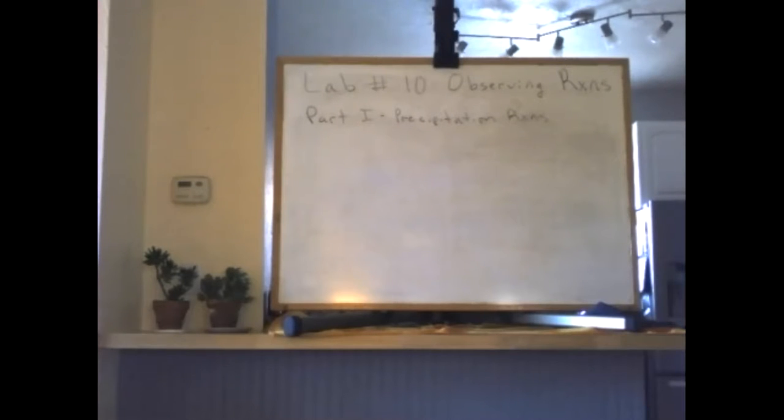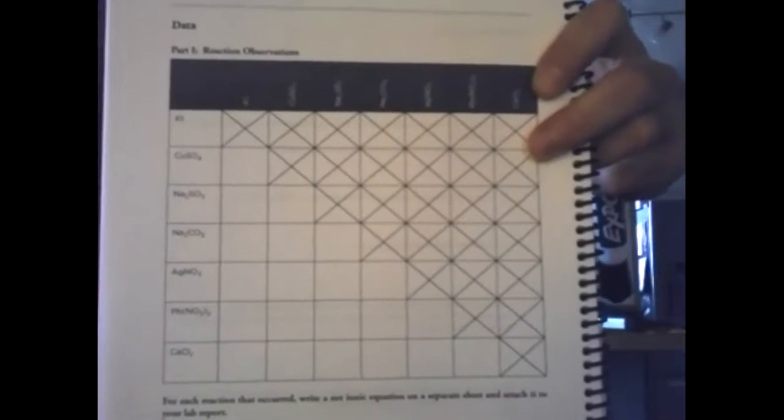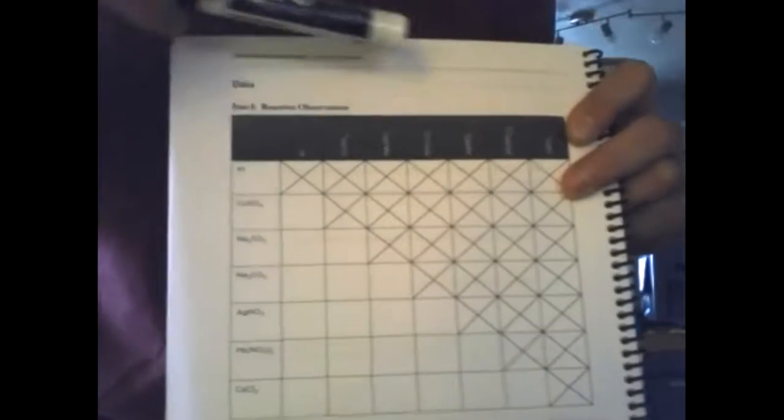Okay, so let's look at this table on page 92. Everyone sees this table on page 92. All right, the video follows this pretty well. In the beginning, let's look at the top row of this table. The reactions we're first going to look at in Scott's video, he's first going to take an aqueous solution of potassium iodide, and he's going to react it with all of the following solutions. So we'll be filling out this table a column at a time.